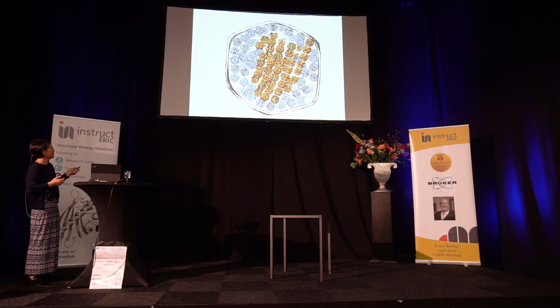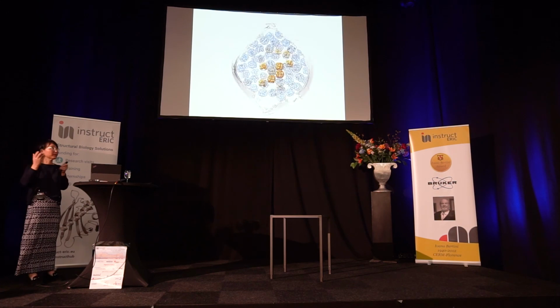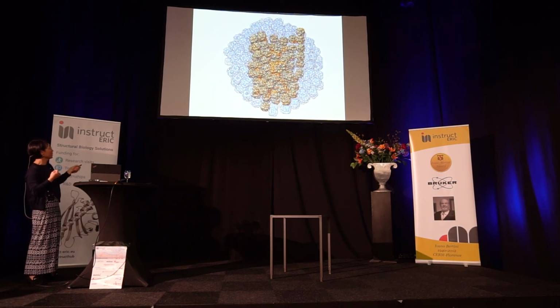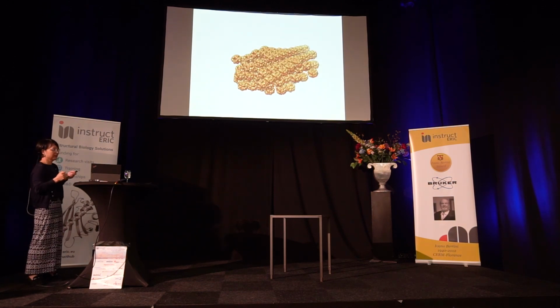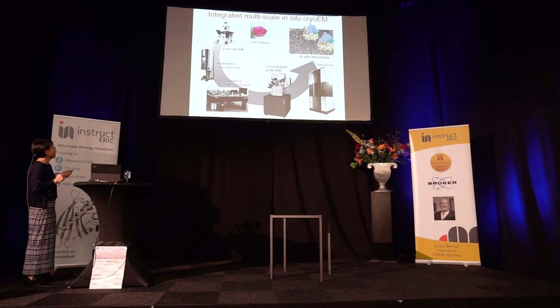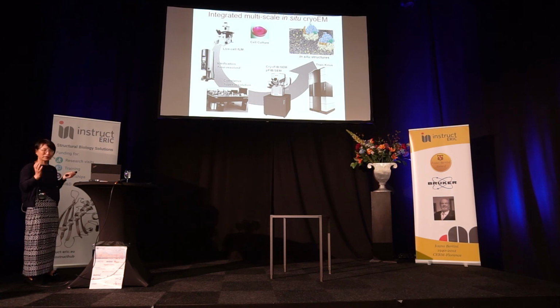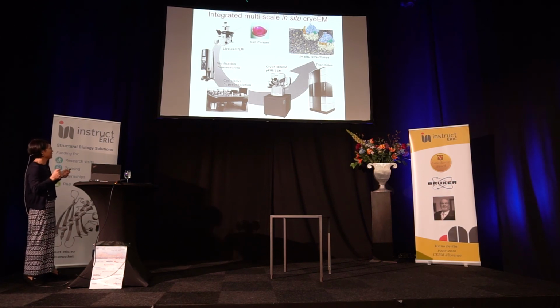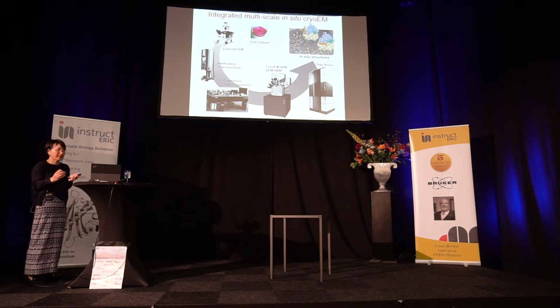That's what we find. You have these Rubiscos in the center that form spiral arrays, and they are dispersed along the outer layer of the alpha-carboxysome, and those Rubiscos have the CsoS2 to bind and organize. So with this, I would like to end with this picture here. I think in the future, in situ structure determination in different conformations, different protein connections and pathways, has great power and potential, from just cells or even tissues, to correlate with light microscopy, as well as cryo-fluorescence using FIB-SEM to do the 3D volume, to gain insight into protein complexes actively involved in signaling pathways or in cellular processes.